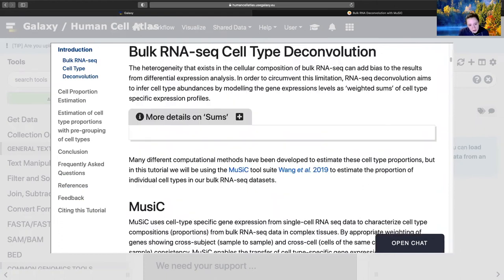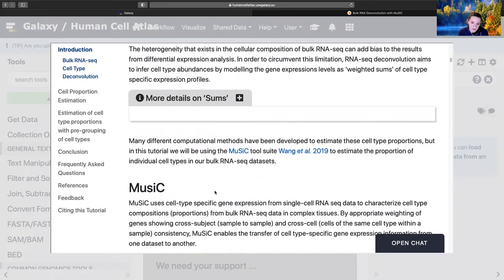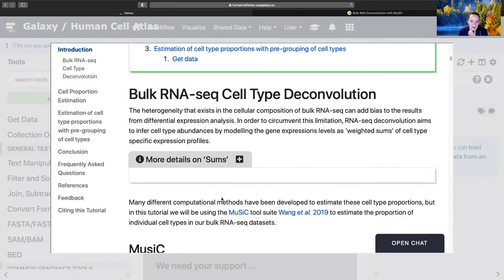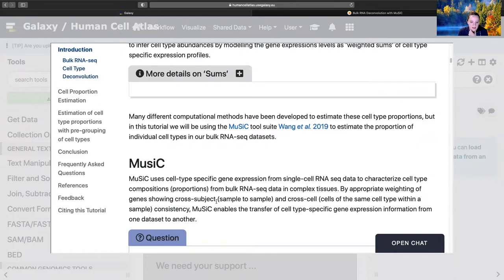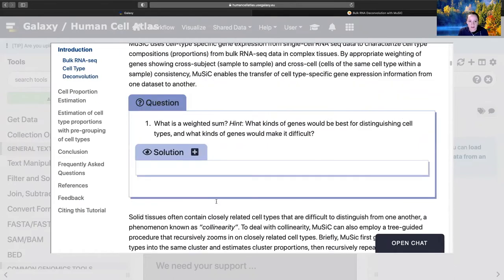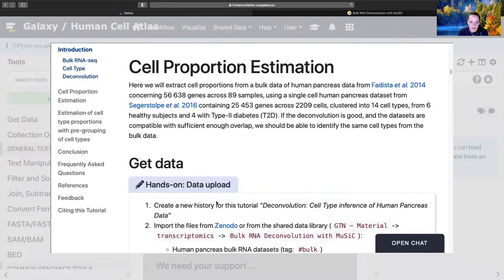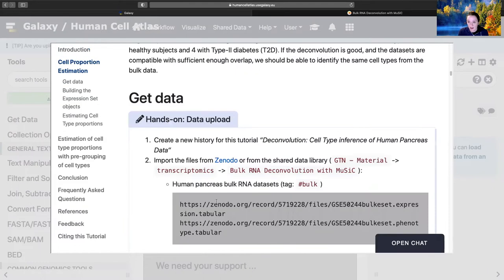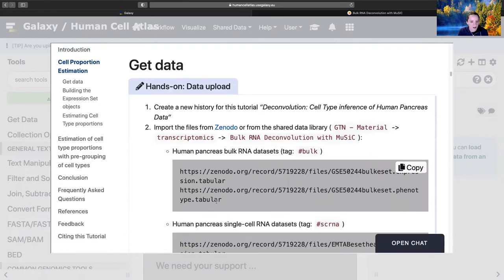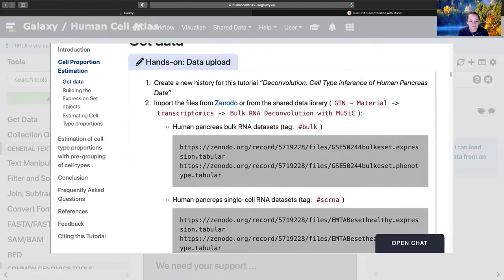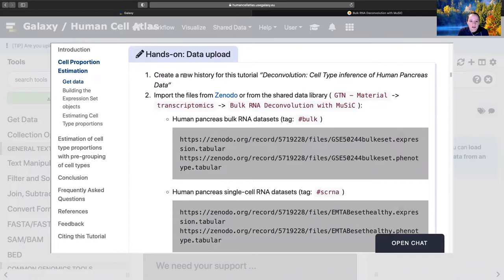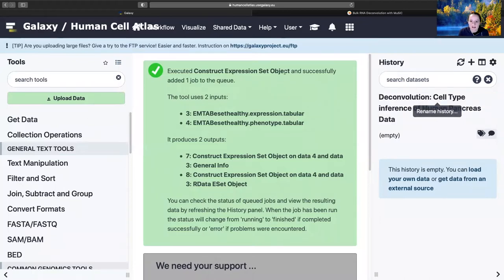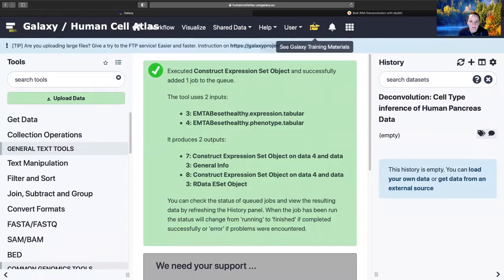There's a beautiful description within this section, so please do read it. But like I said, that's not the purpose of this video. This video is to help you get through the clicking and finding all the parameters and making sure it works. We're going to start with creating a new history and saving it.